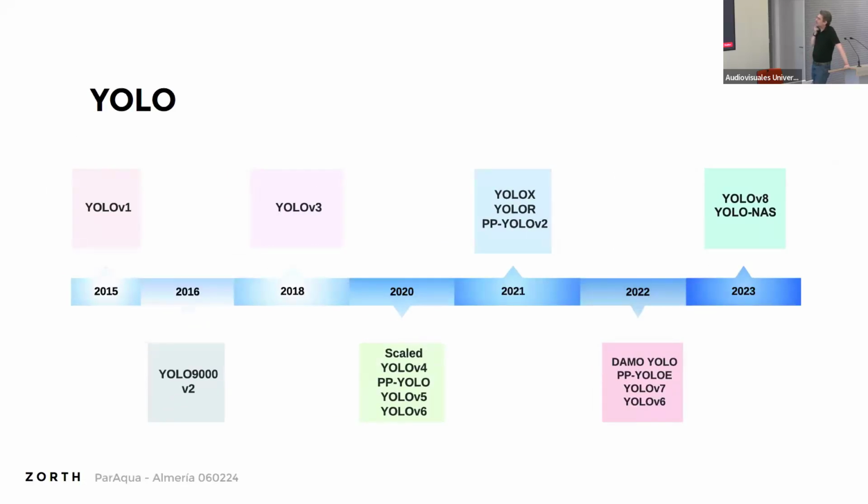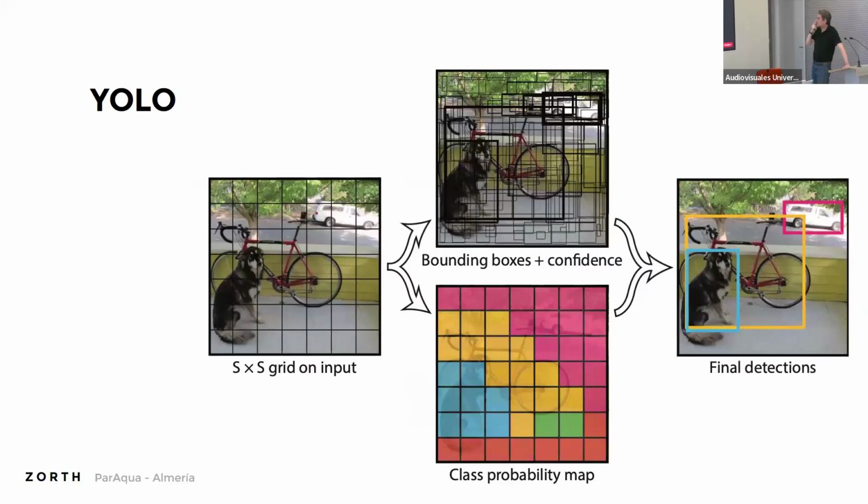Well, let's look at how it went on. The first YOLO was devised in 2015. I started using it in 2018, so that was 5 years ago, with YOLO v3. And then it started to spawn some evolutions. YOLO v5 was the first one that used multi-scale resolutions, which was really interesting for what we do in microscopy. And we are currently at YOLO v9. I've only implemented YOLO v8 up to now. That's a very, very strong framework, and there's a lot of commitment from researchers.